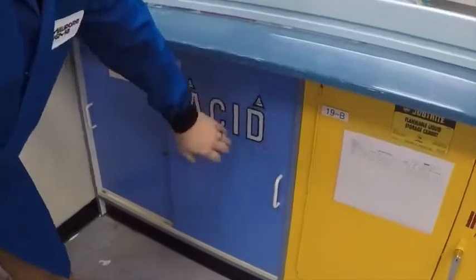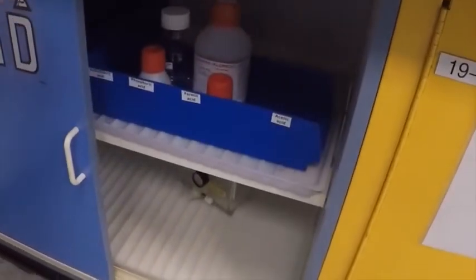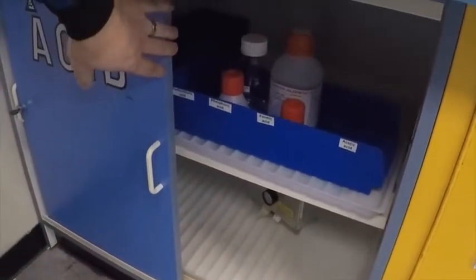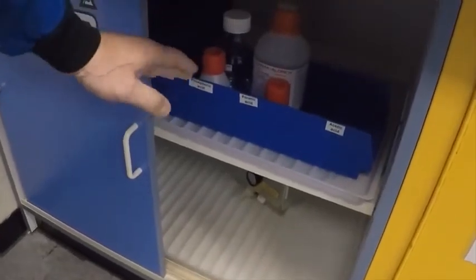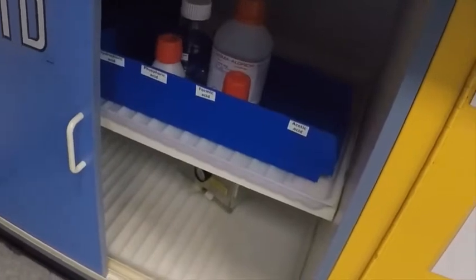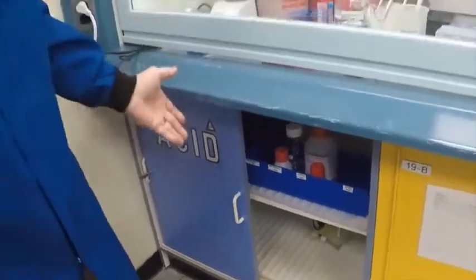Flammables must be kept separate from your acidics, which will be stored in an acid cabinet. Acid cabinets typically have a phenolic liner and phenolic construction rather than metal, because of the corrosive nature of the acids. Again, secondary containment and proper labeling for all materials. All acid bases need to be kept separate, so you will have another corrosive cabinet to store your bases in.